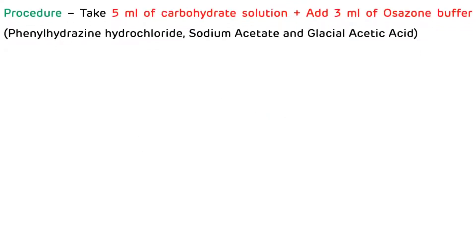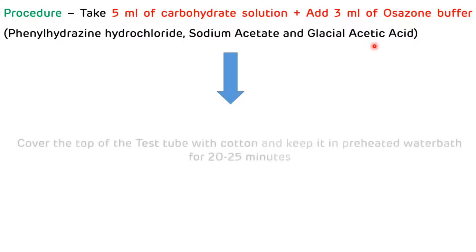Now we will see the procedure of the osazone test. First, take 5 ml of carbohydrate solution in a test tube, then add 3 ml of osazone buffer. The osazone buffer contains phenylhydrazine hydrochloride, sodium acetate, and glacial acetic acid.